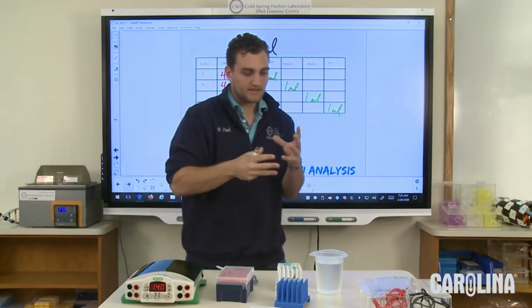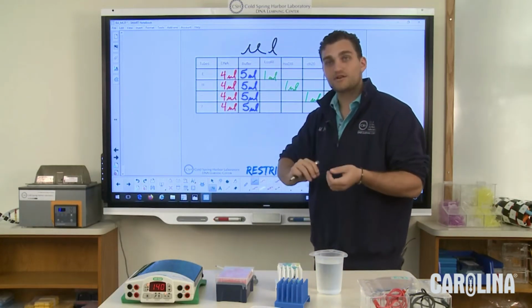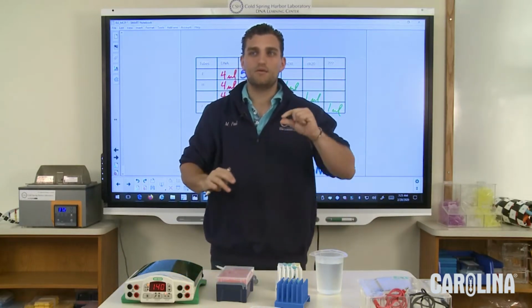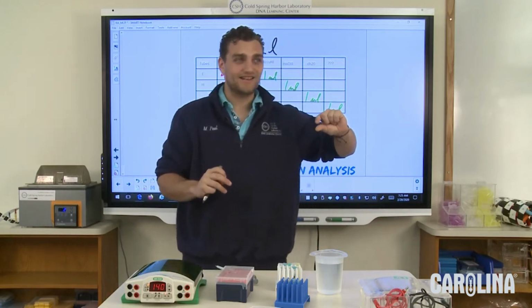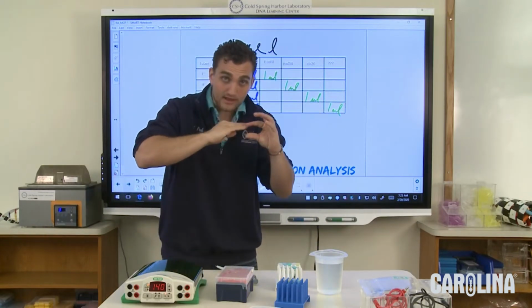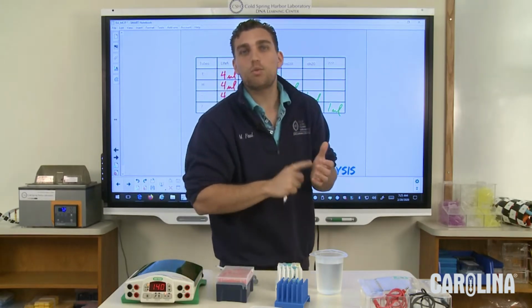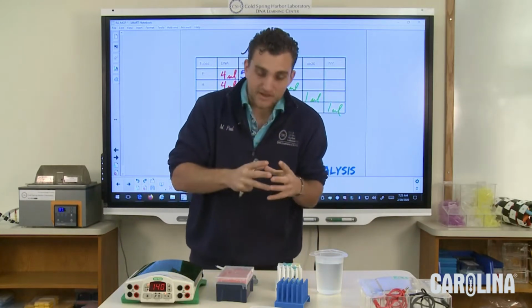Now, I always like to put this into some form of context, right? So you take 1 liter, you cut it into 1,000. What do you have 1 of if you take 1 of those pieces? A milliliter, exactly. Now you take that milliliter, you cut it into 1,000. Then you have 1 microliter. So 1 microliter is 1/1,000,000th of a liter. It's a very, very small volume.